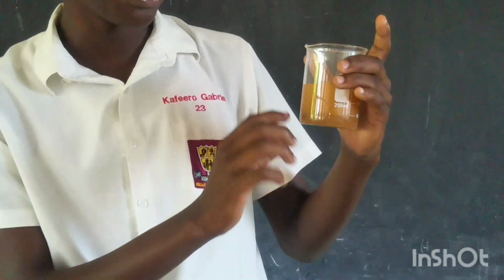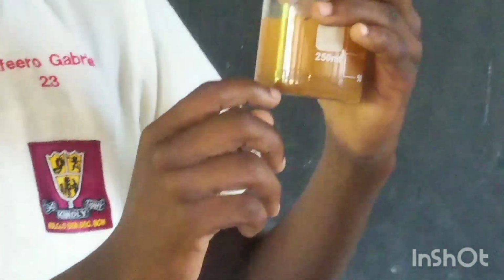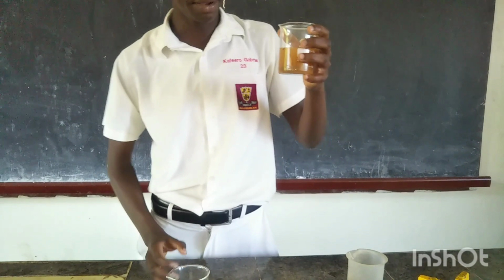As I told you, there are like 3 layers. The first layer here is the layer of the sand, and the second layer is above the sand. It's a bit dark, so some particles are contained in this second layer. Then the third, upper layer is just the layer of the water. So let me get this water and pour it into my empty beaker so that I can get the final result.